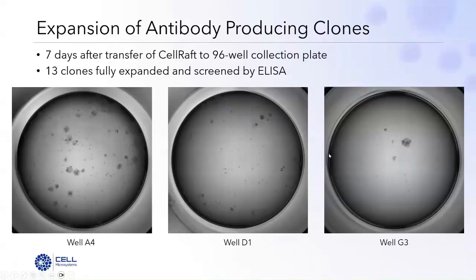And I think this really highlights what can happen to cells over time as they begin to drift and their phenotype begins to change, even in a population that was once clonal. So having this level of screening power allows us to not just settle for cells that are growing, we can actually find the cells that we want that meet our best characteristics and continue to use those.